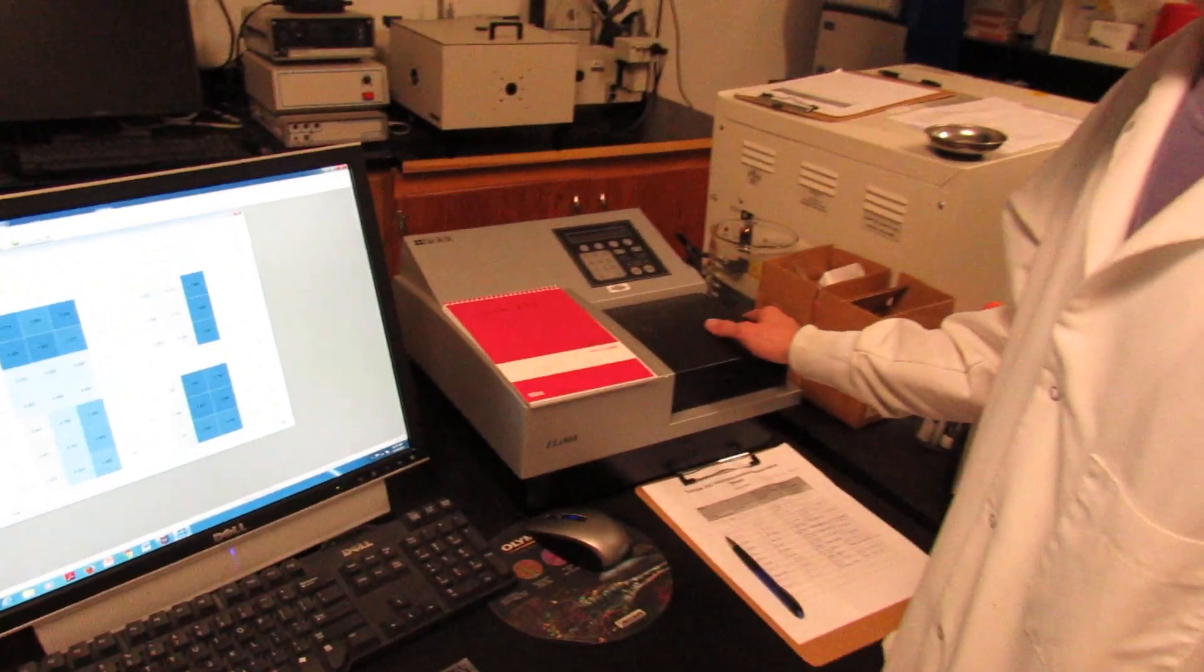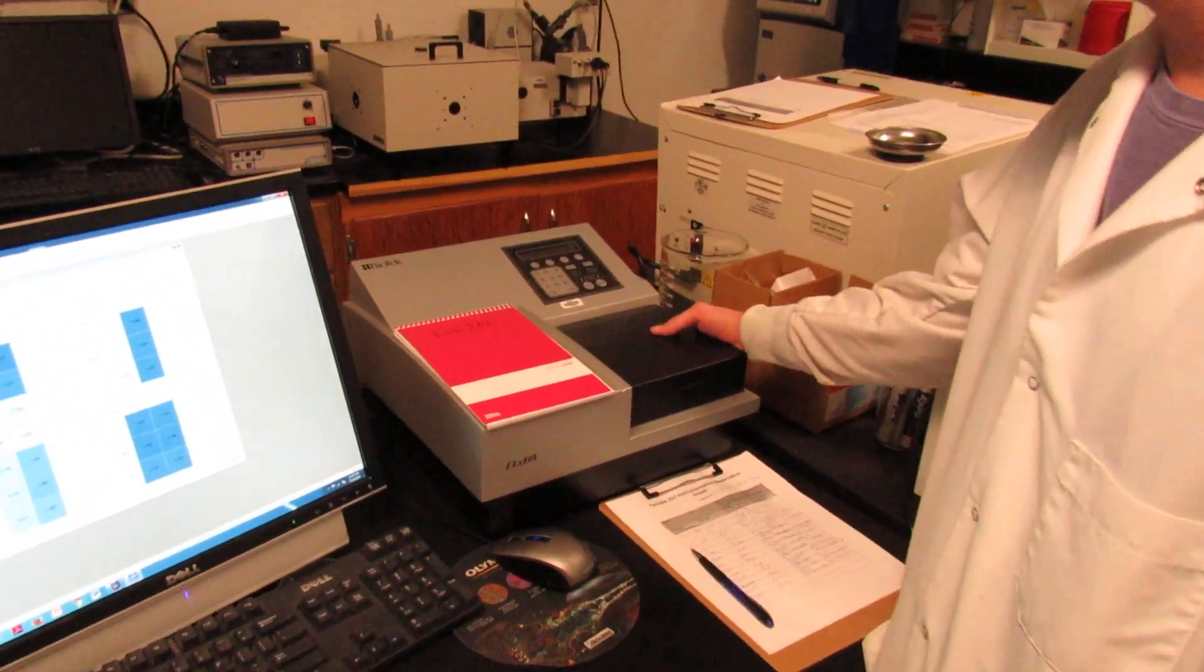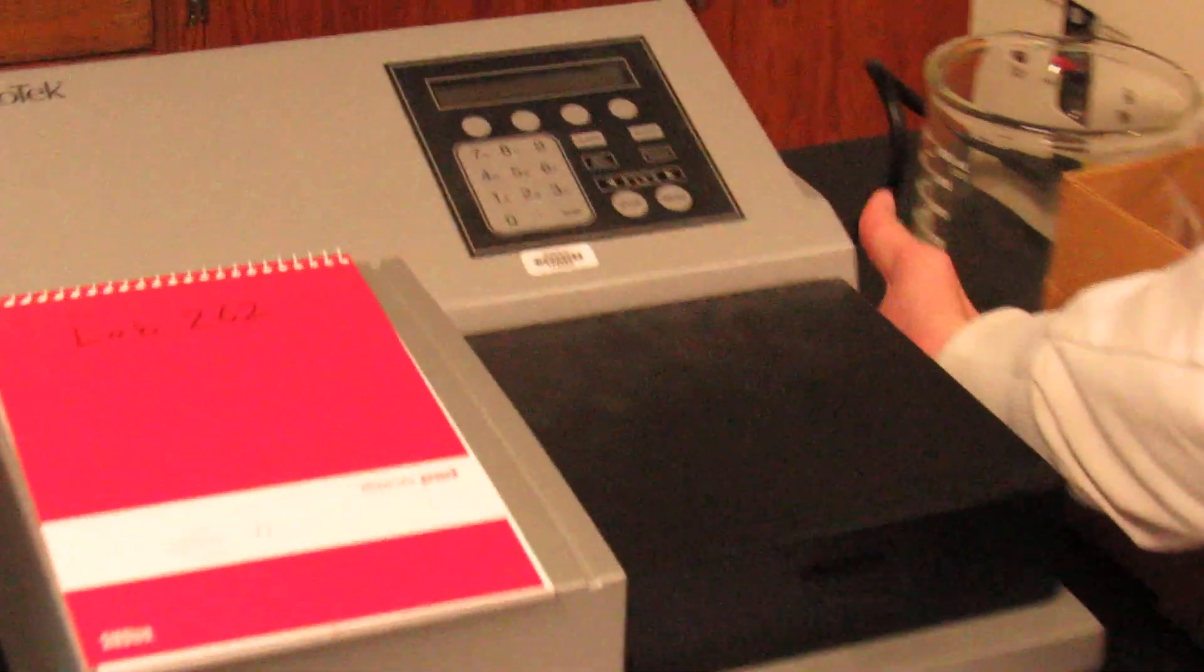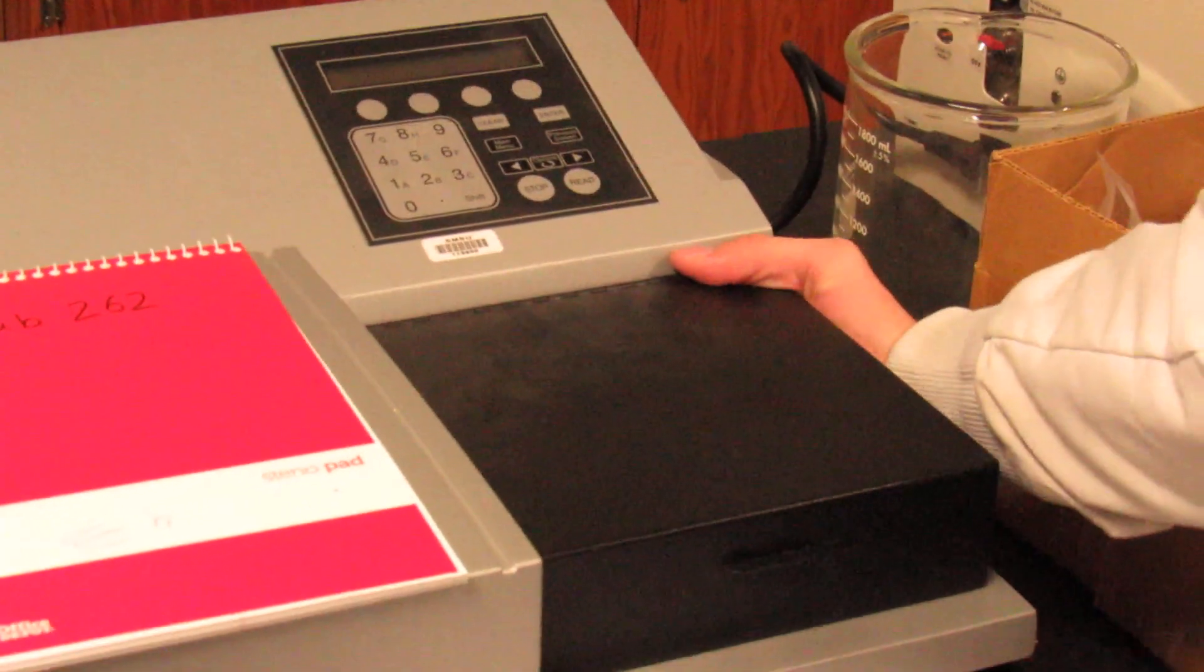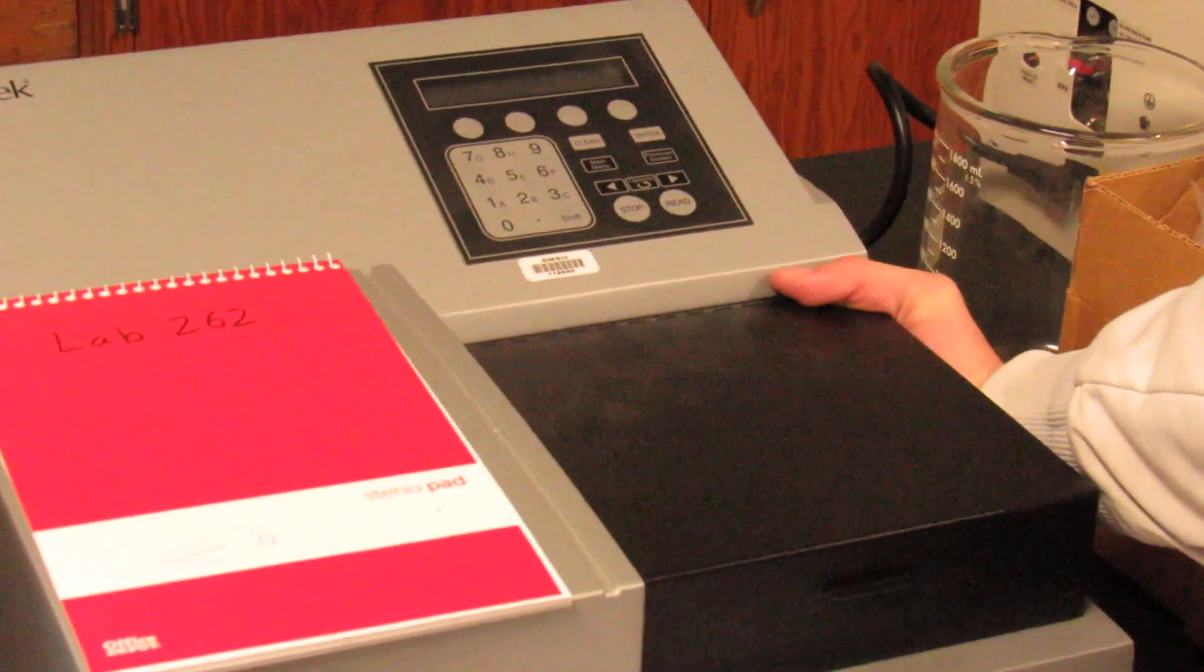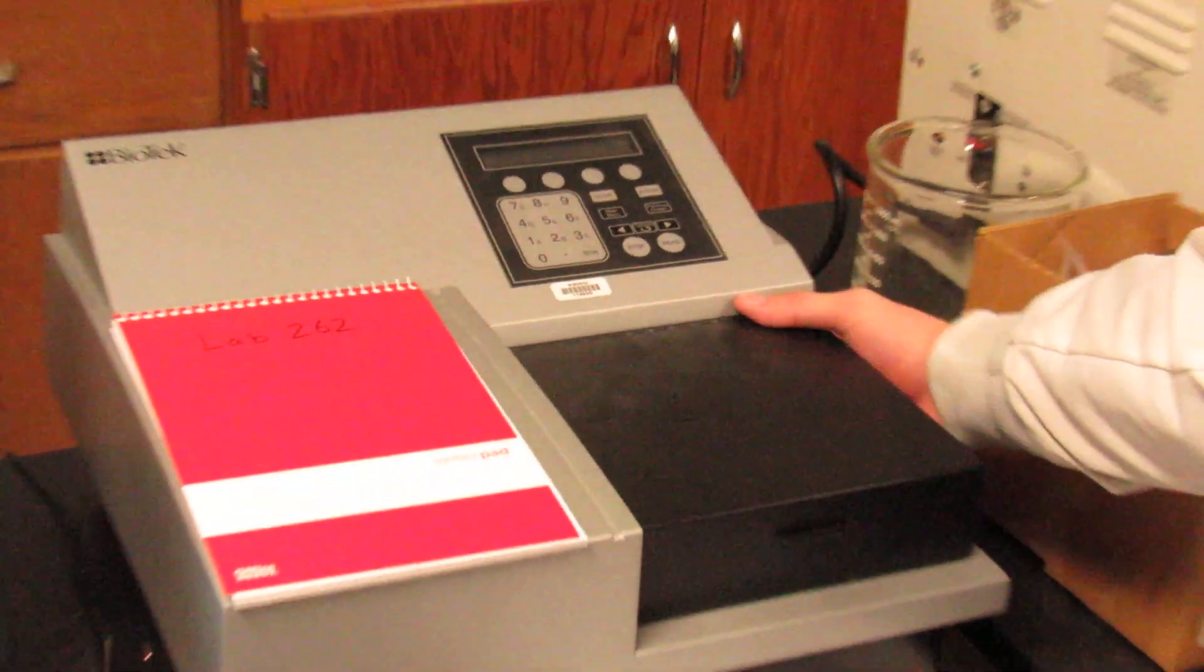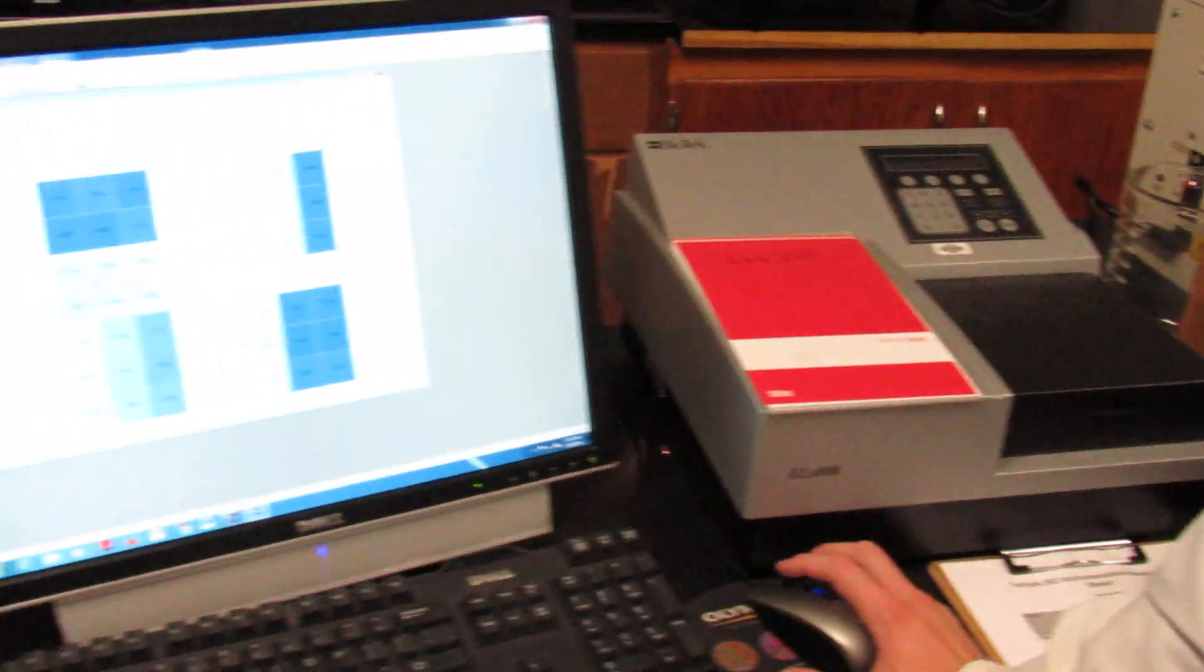Next, you're going to want to make sure that the plate reader is turned on. To do this, there is an on switch on the right-hand side of the machine. You'll press it on. It'll take a few moments for it to turn on. It'll do its start-up sequence. So give that a moment to start up.